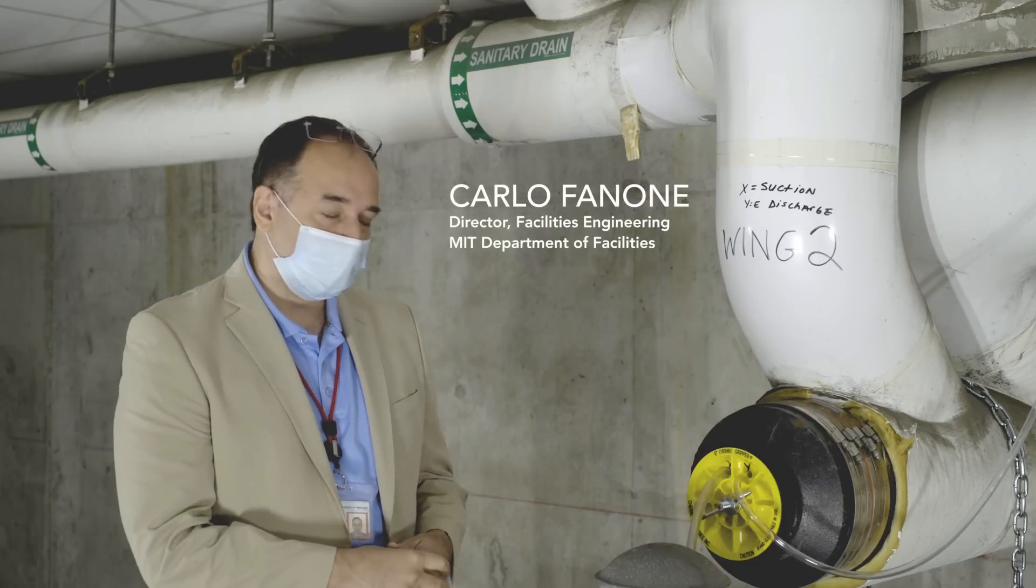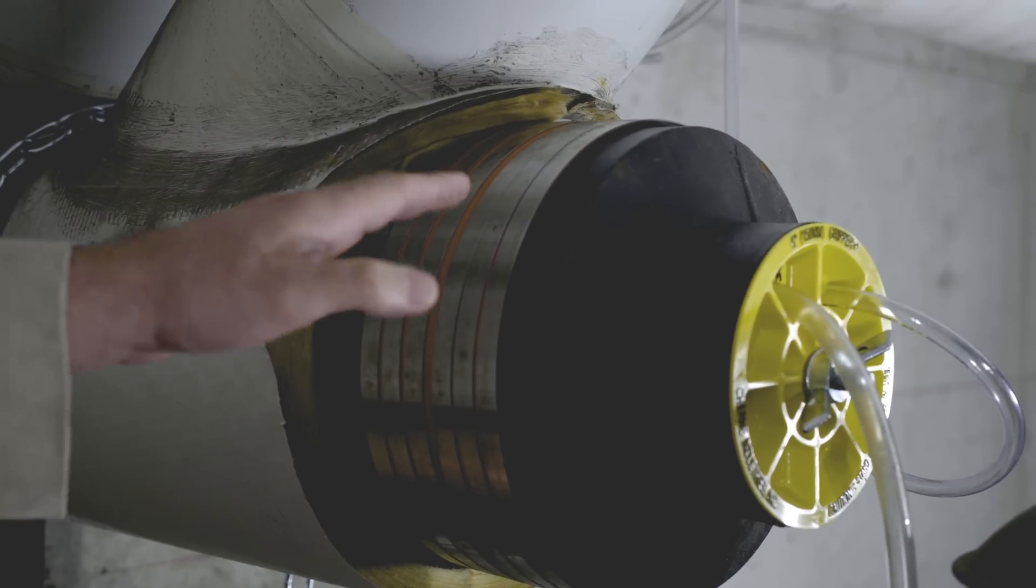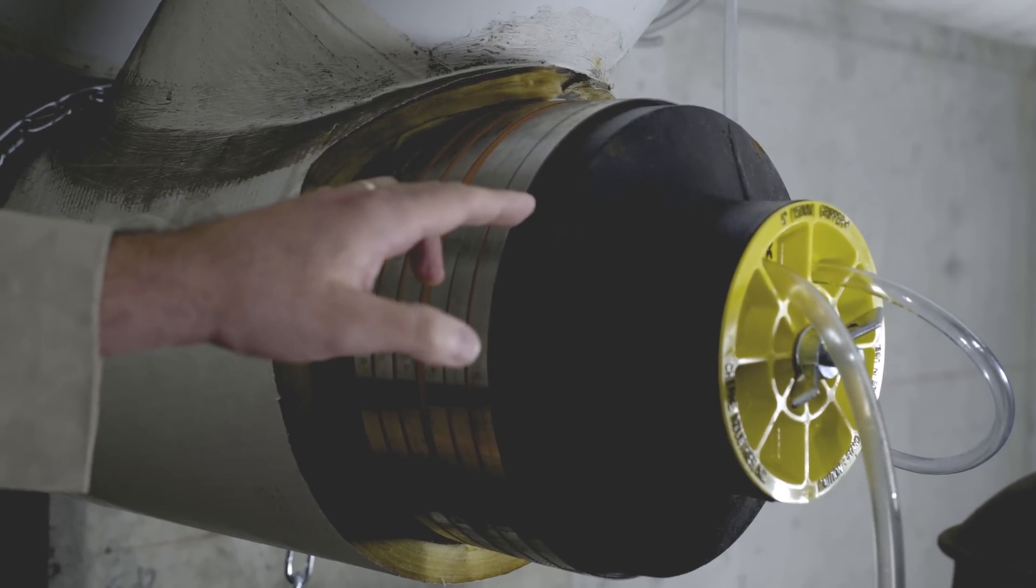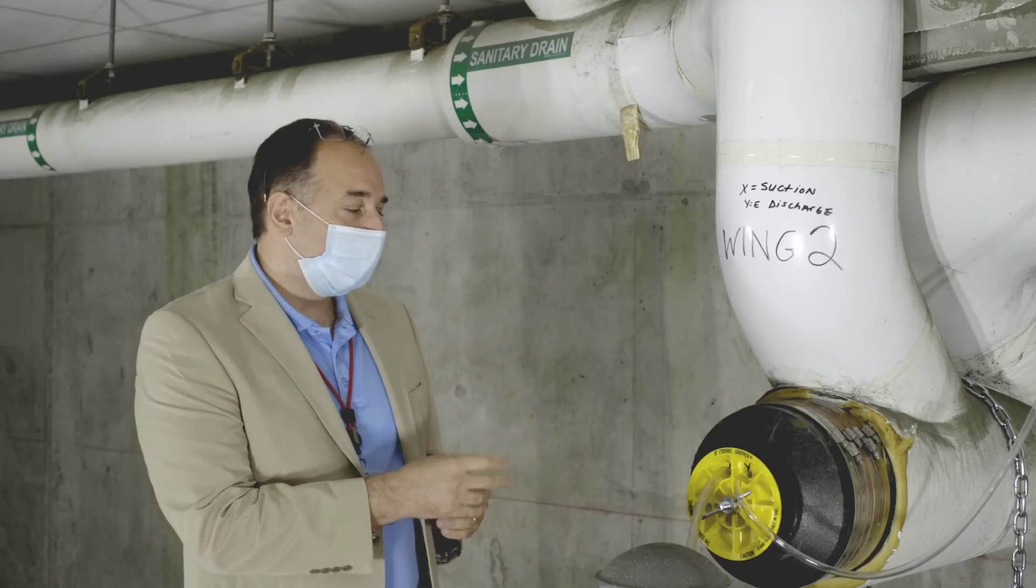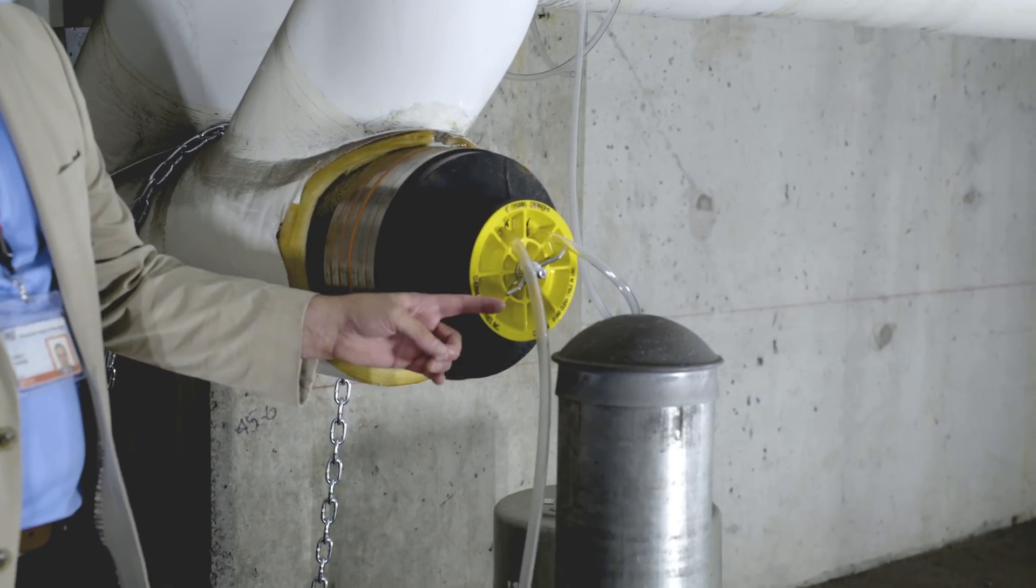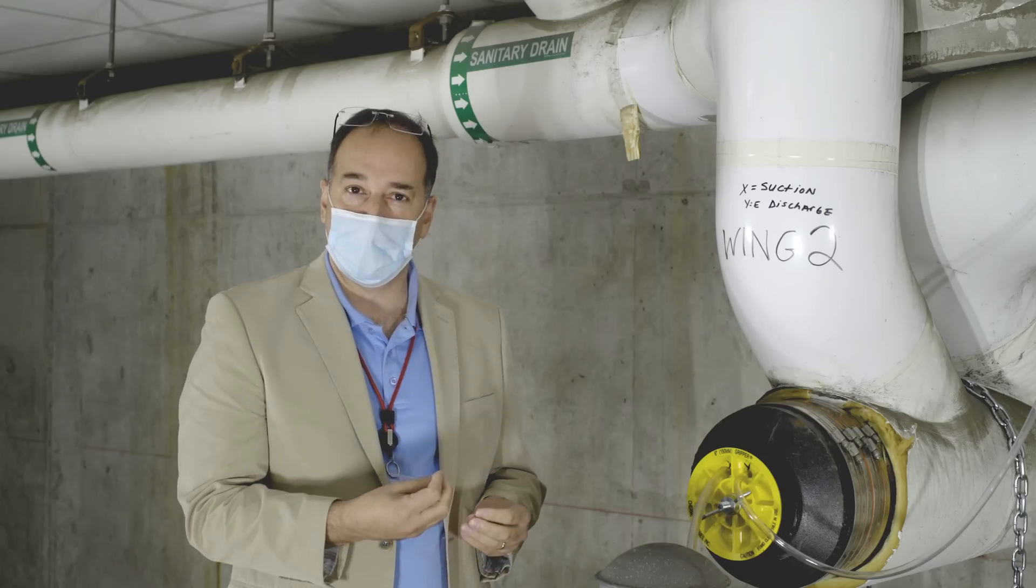The apparatus and system we're using is very simple. We modify our sanitary piping, specifically the clean-out section, and insert a gripper plug. We then create a test port out of that modification and put pickup tubing inside the sanitary line to collect the samples used for testing.